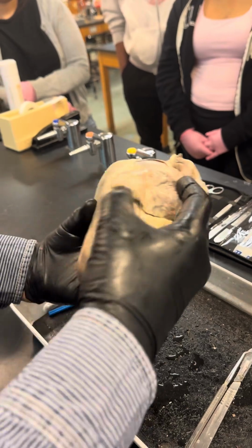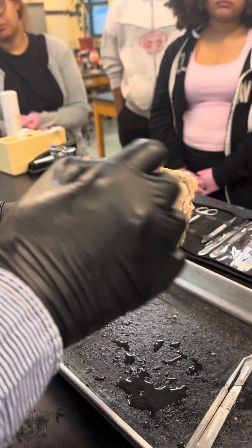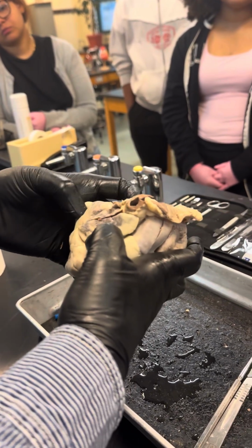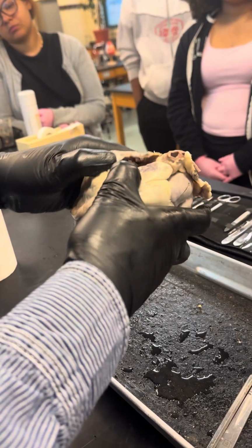It looks like an ear. See, it looks like an ear. Auricle. Left auricle, and the right auricle is here. This is the right auricle. Okay, this is the right auricle. You can remove some of the fat. The right auricle. I already dissected it.